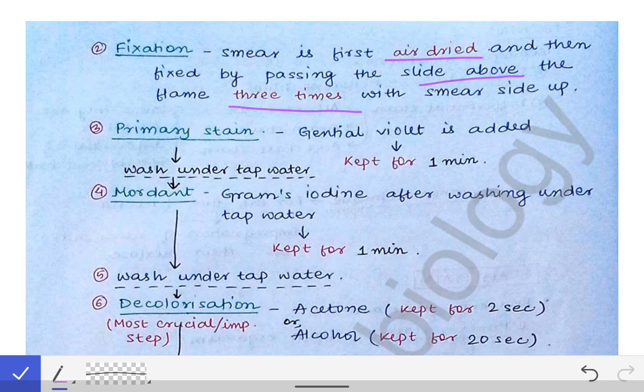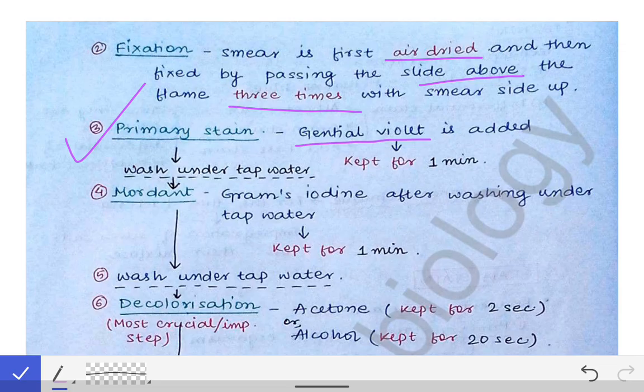Once the slide is air dried, we pass it over the flame three times with the smear side up. Then we proceed to the primary stain. We take the gentian violet and add it over the smear area, keeping it for one minute.